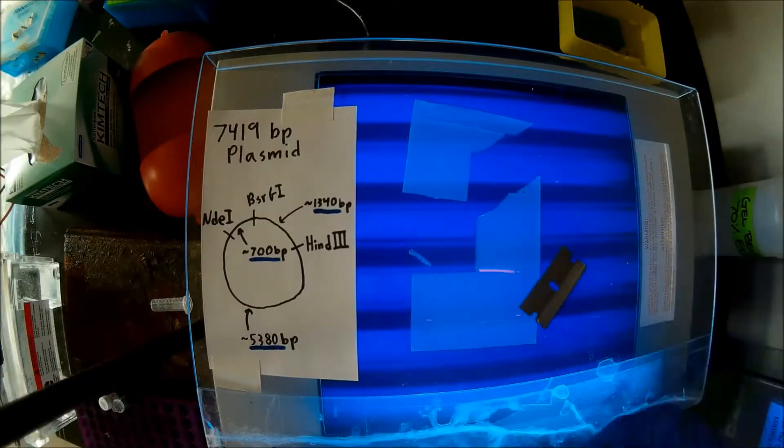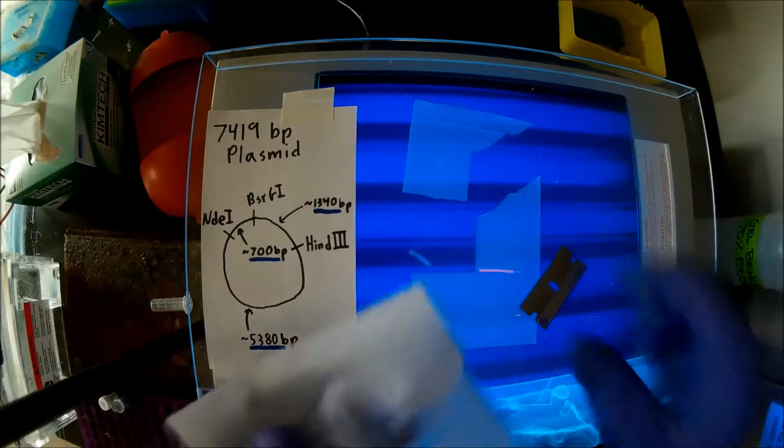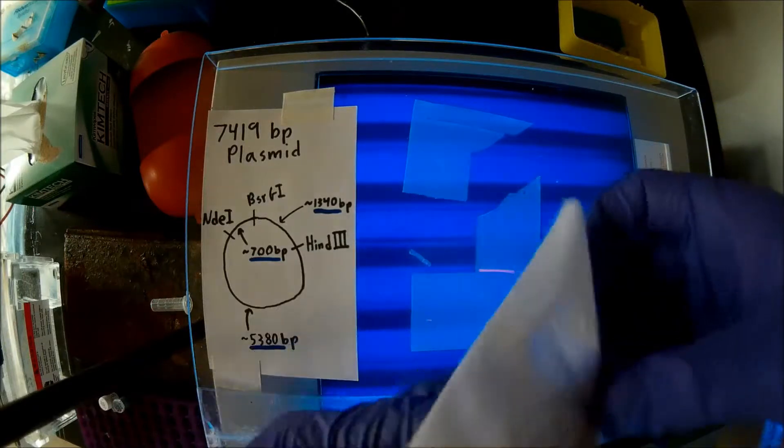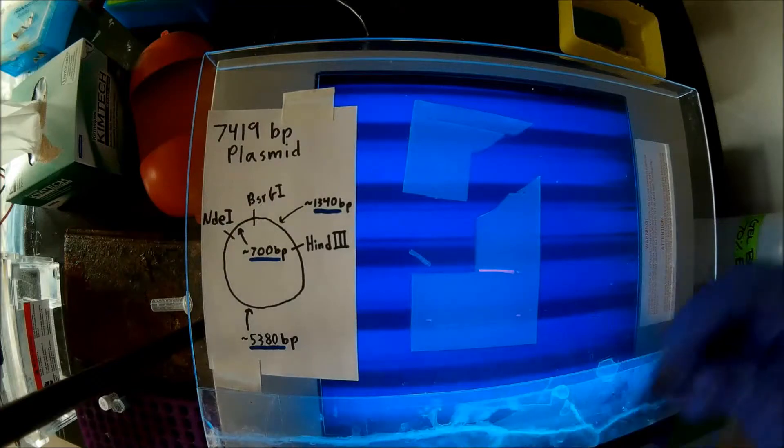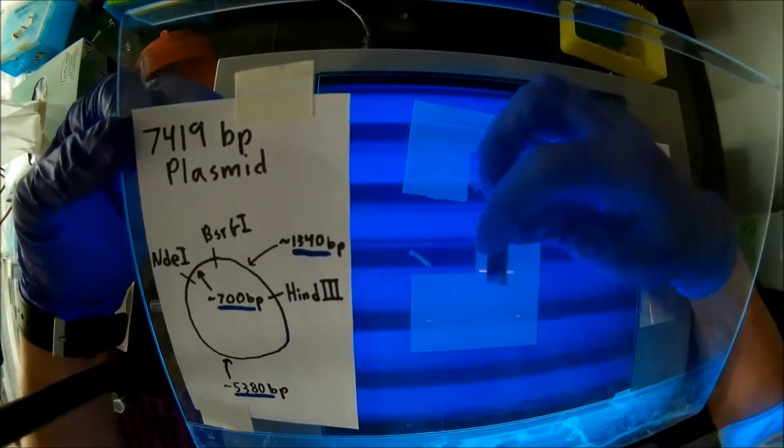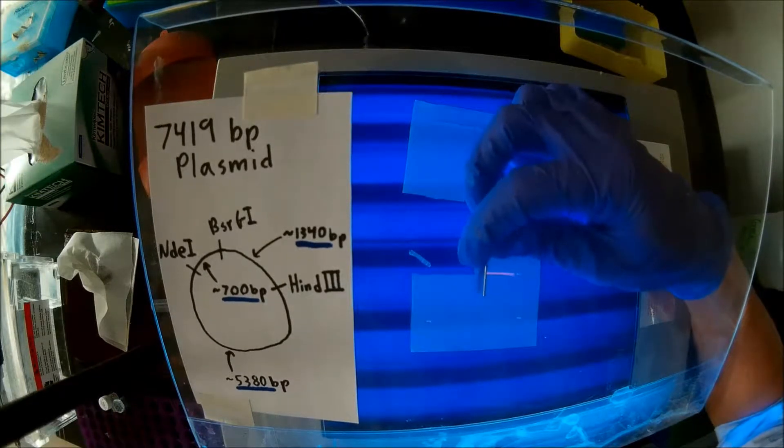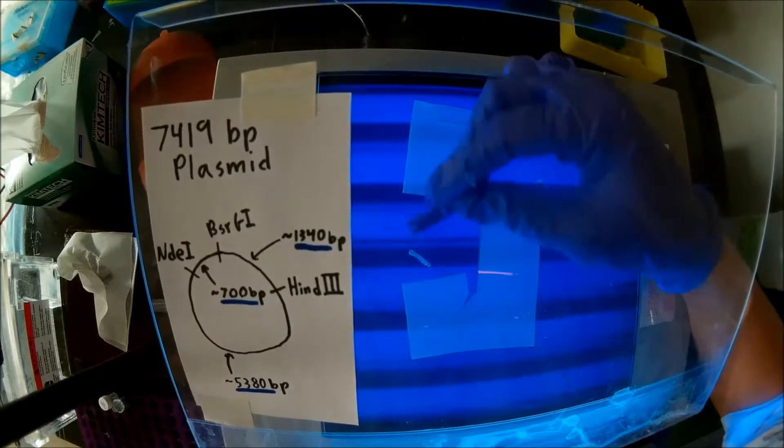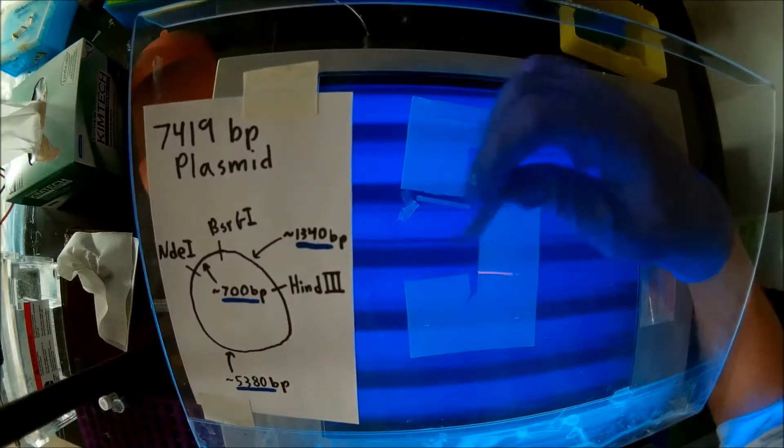So, again, now I'm going to go for the second one. We'll clean that off briefly with 70% ethanol again. You can tell that this razor blade is getting a little bit old because it's kind of cutting raggedy on the agarose. So, I'm going to take off this little remaining bit here because I don't want to contaminate this band with any of what was over there.